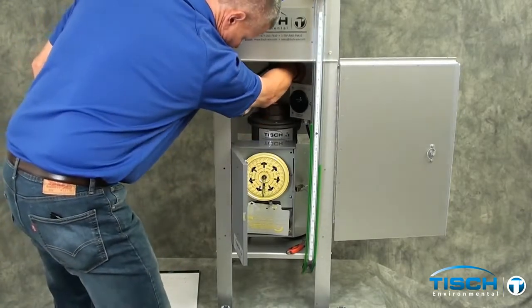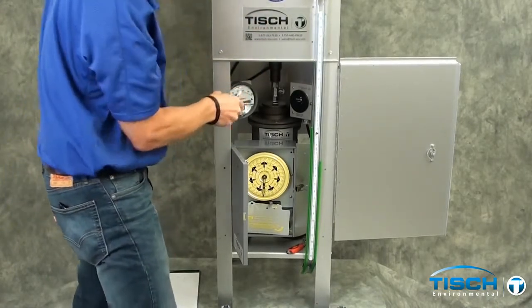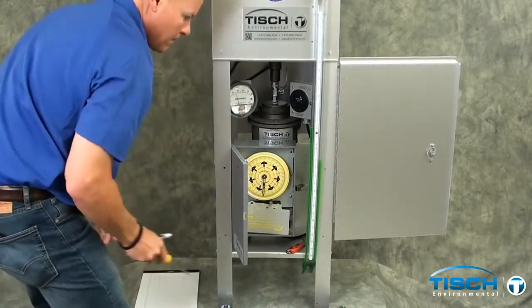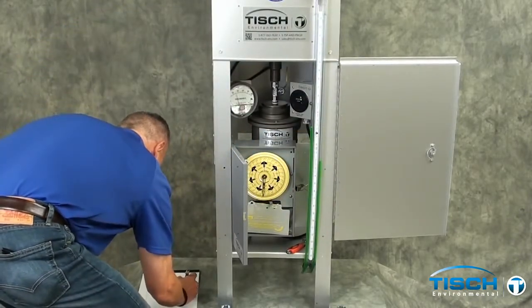Again, move the ball valve away from you and get the fifth and final point, which is 30 on the magne-helic gauge. In our example, the first leg went up 2.2 inches and down 2.0 inches for a total of 4.2 inches.